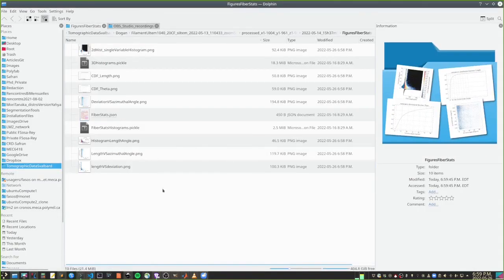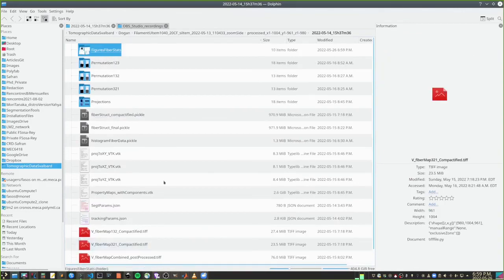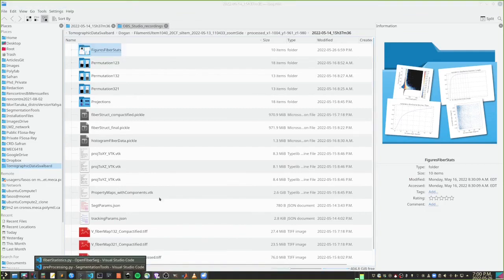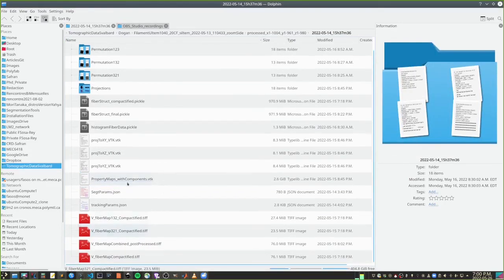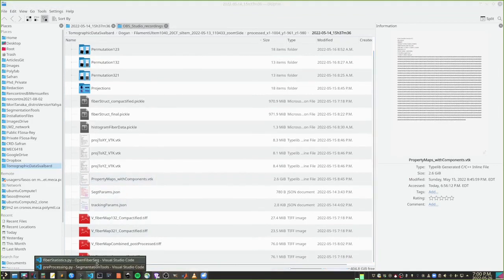So basically that's it, the step is done. I didn't launch it now, but once you process the entire thing, you're going to get these property maps. It was just property maps in the one I put in the public version, but you can basically reproduce the figures I made in the paper.